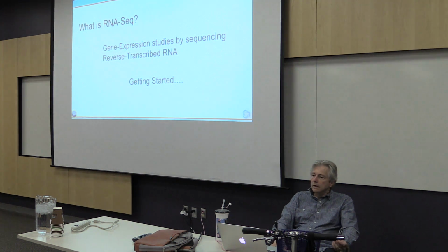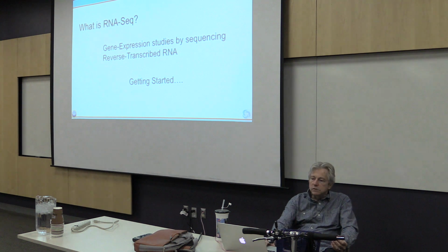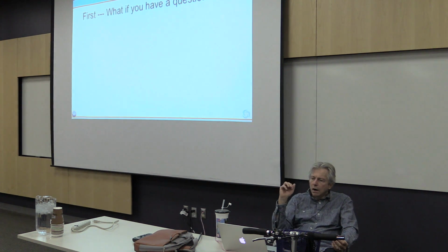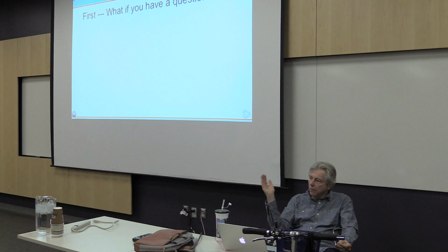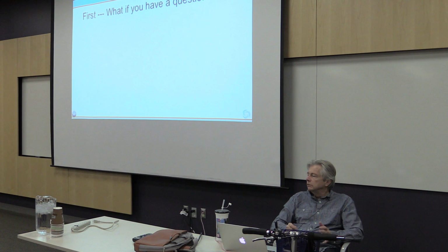And beyond messenger RNA, which is most of what we're looking at, it's not just the messenger RNA, but also what controls the message in the form of interfering RNAs, microRNAs, silencing RNAs. So there are a lot of different types of RNAs, and of course ribosomal RNA, which could swamp your signal. So a lot of times you start out by getting rid of the ribosomal RNA.